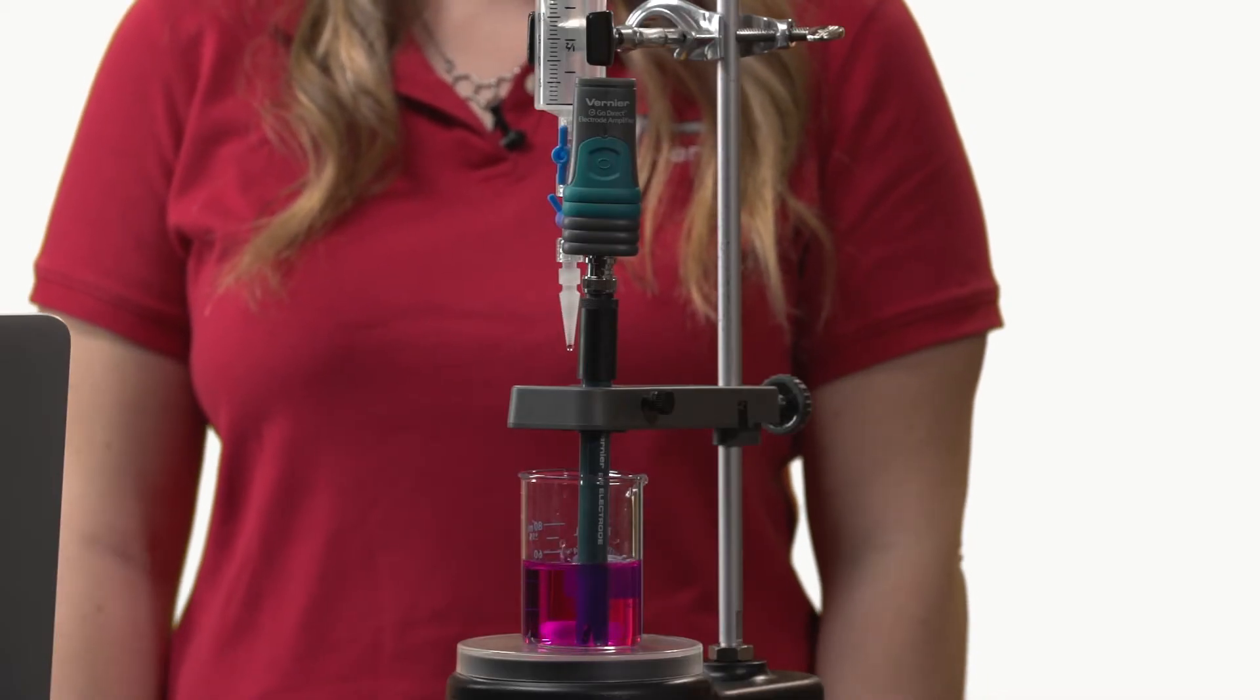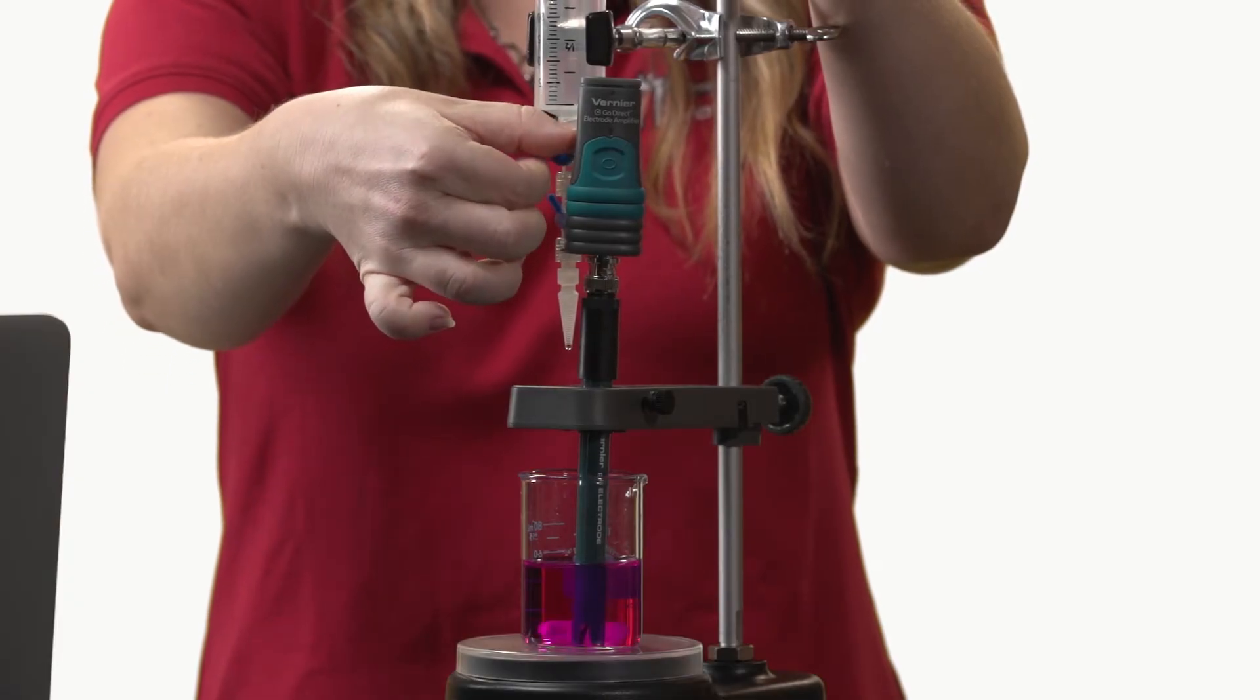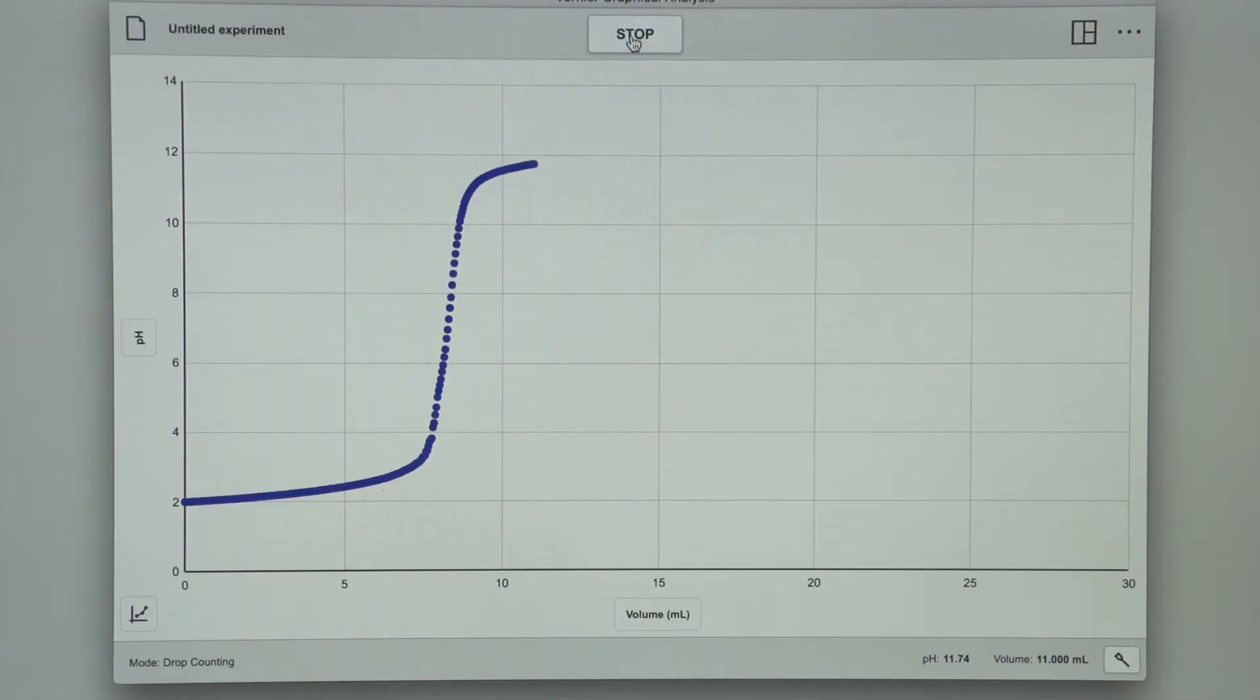Once my titration is complete, I can close the stopcock and stop the data collection.